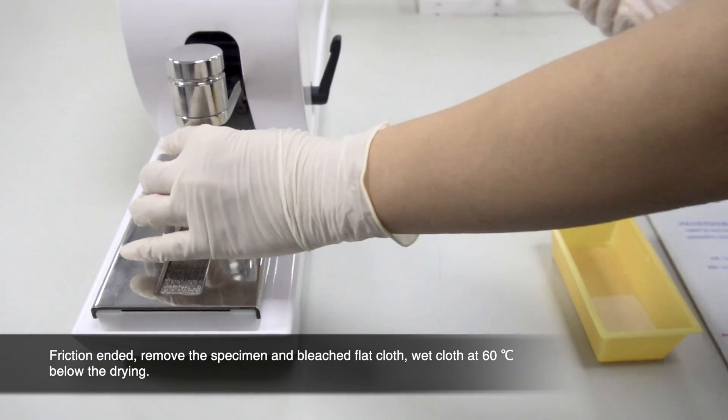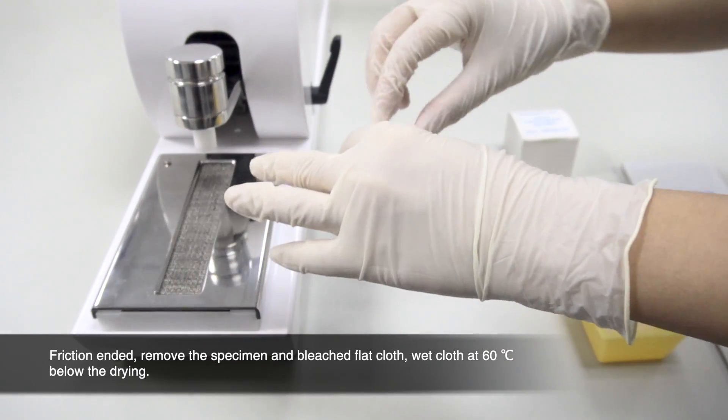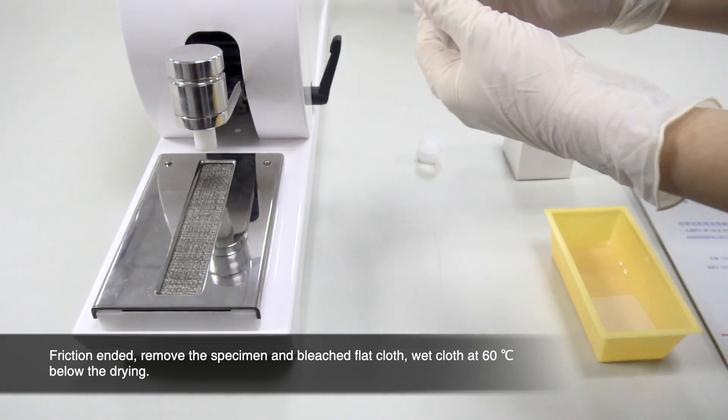After friction is complete, remove the specimen and bleached flat cloth, and dry the wet cloth below 60 degrees Celsius.